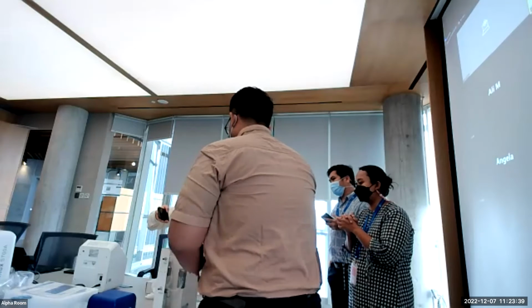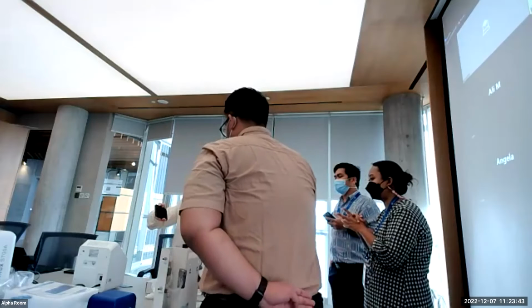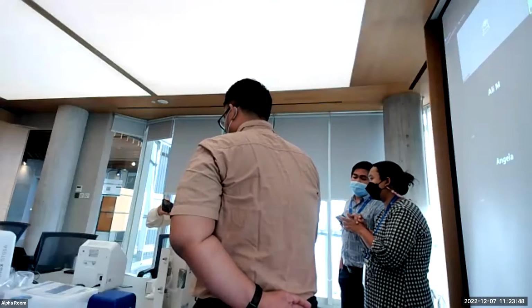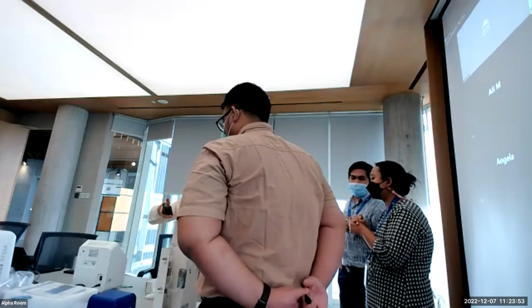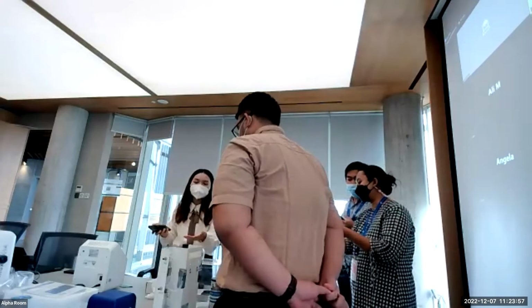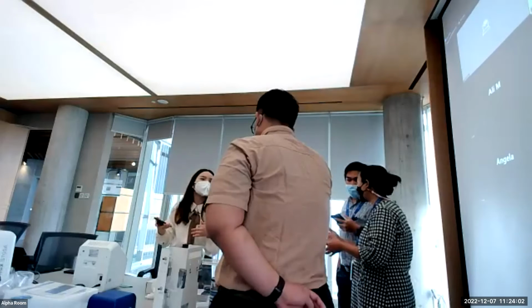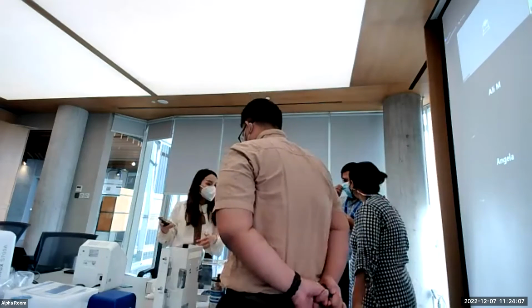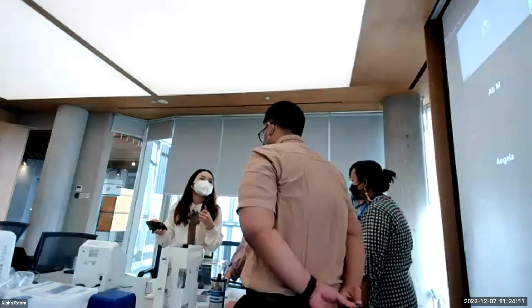Hello. Okay. Actually, for the small animal, the maximum weight is 10 kilograms. Yeah, 10 kilograms. But for the big animal anesthesia machine, that's 100 kilograms.